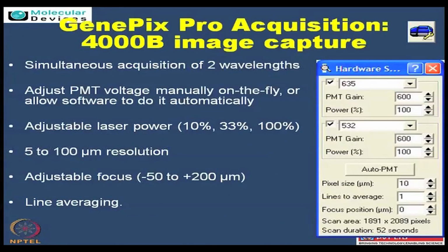There is a button towards the side where you have a control for the scanning time. As it is a dual channel scanner, meaning two lasers are present, you can select whether you want to use 1 and 2. Based on the user application, you select both the lasers, and at the level of light scan, you control the PMT and the resolution you want to use. These are all within the same software. Towards the right-hand side, you see the pane with the hardware control button, where you can also look at the different images that suit your own biological application.